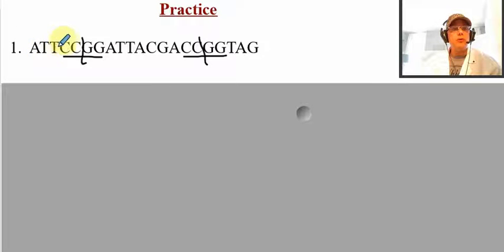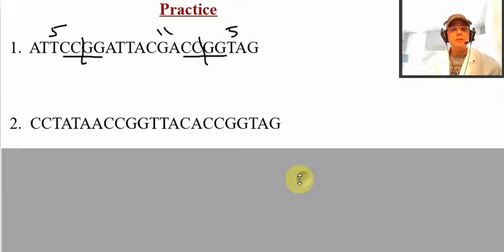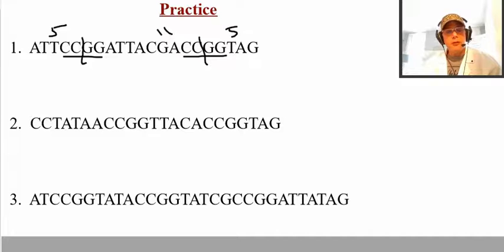And it is 1, 2, 3, 4, 5. 1, 2, 3, 4, 5, 6, 7, 8, 9, 10, 11. And this last one is 5. And we could do the same for these two also. But the fact is, we were able to do this, but you cannot measure DNA in this fashion.